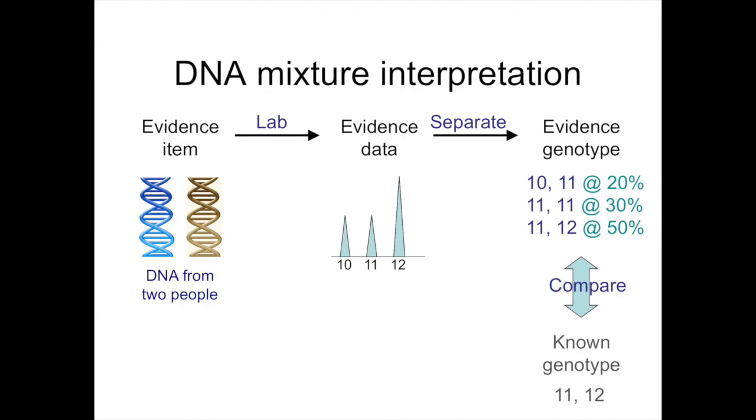And the only change conceptually, which is quite reasonable in the 21st century, is that if the data don't give you one unique answer of the, say, 100 possible allele pairs, it's giving you a list of possibilities with probability. And so the way uncertainty is addressed in modern science is with probability. And the math doesn't care, and actually juries are fine with this as well. Ultimately, when you make a comparison, as shown on the bottom right, if that known genotype were an 11-12 from a defendant or another individual at that location, we see the 11-12 has 50% probability. That means the match statistic is halved. Instead of getting 100% of the match statistic, you only get half of it.